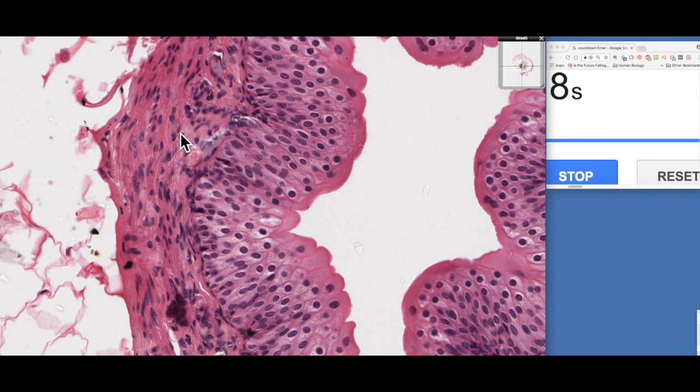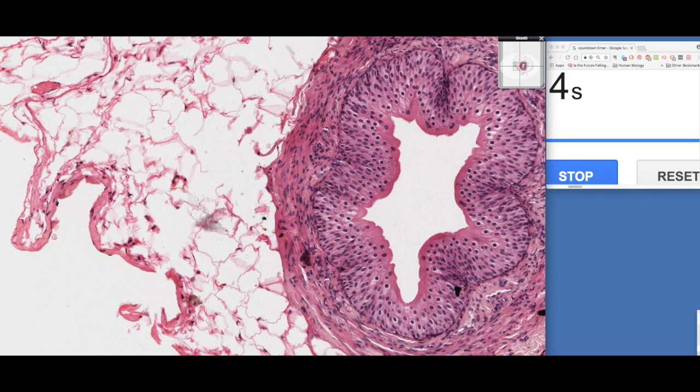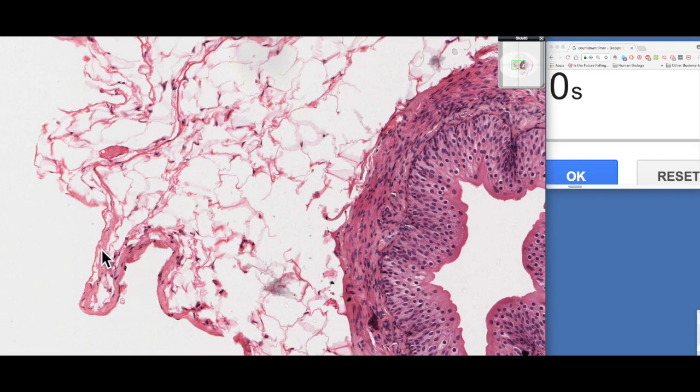So if we go back to our original image here, then external to that, we actually have connective tissue. There's lots of adipose tissue out on the outside here, and there's a bit of a serosa on the outside. You can see the simple squamous lining of the serosa.